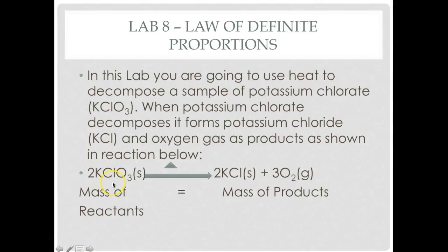We're taking potassium chlorate, KClO3. From the formula, it indicates there are 3 oxygens in KClO3. If you take this compound and heat it, it decomposes.